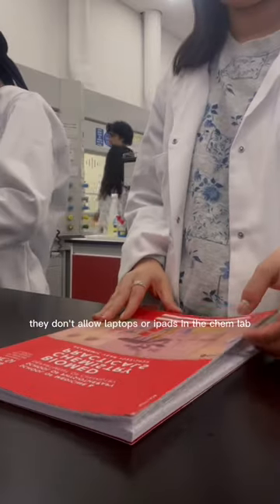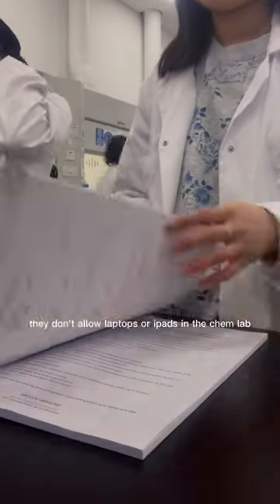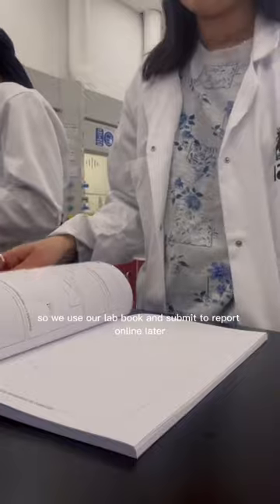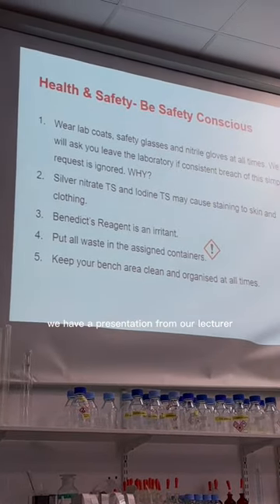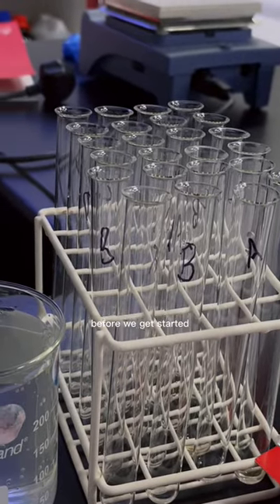They don't allow laptops or iPads in the chem lab, so we use our lab book and submit the report online later. We have a presentation from our lecturer before we get started.